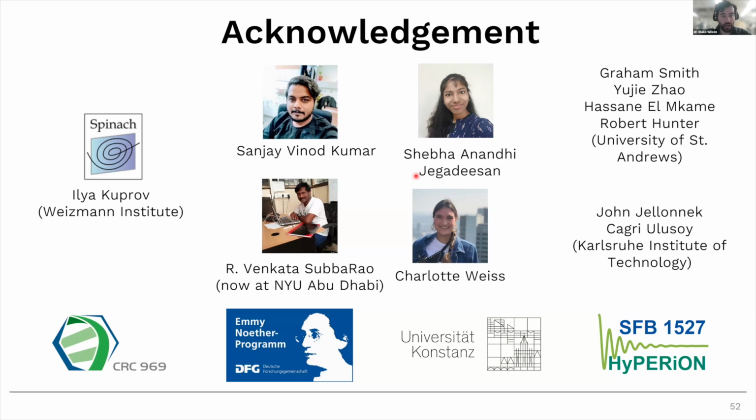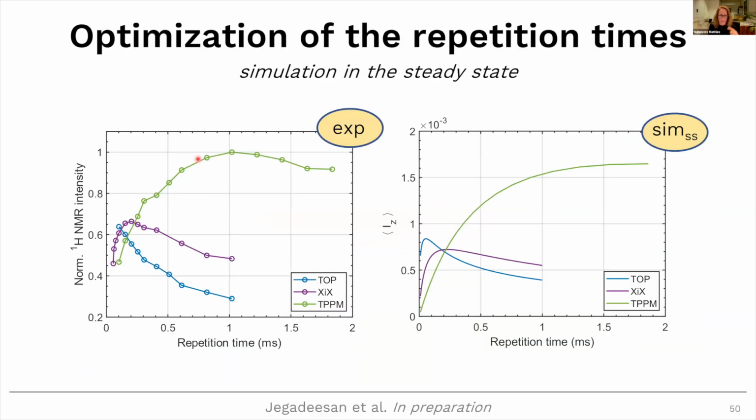I think it's just a question about how the T1 relaxation is related to the spread of the bulk proton polarization in the bath. Yeah, we're not explicitly simulating that at the moment, right? Because we have just one electron and one proton. But as it turns out, that already lets you simulate a lot of the features that you see, first of all in your field profile and also in the behavior in terms of repetition time and contact times.